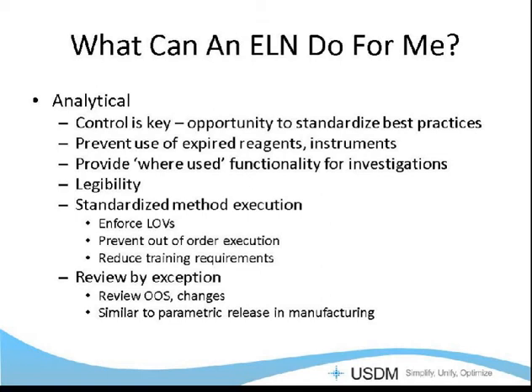You can also tie in your stock management and your instrument calibration so that if an instrument or a reagent is outside of its use window, that can be flagged. It can prevent someone from using it. It can be taken out of a list of values, or it can be flagged. Also, if there's an investigation to determine that there's maybe some particular vendor lot that's affecting your product, you can query on that. So all the details of the experiment, you can query on those and find all the products that might be affected to make your investigation go smoother.